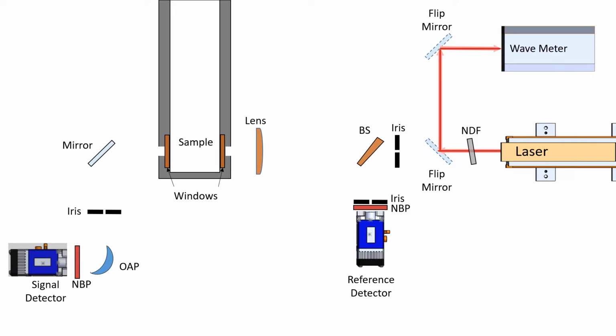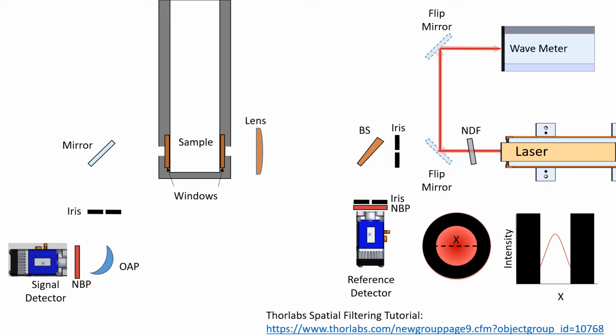Now let's open the shutter. I've eliminated it from the diagram because it's no longer in the beam path. Note the lighter edges of the line. I'm using this to indicate that Gaussian beam profile. If I looked at this laser head on, it would look something like this, where the intensity is greater in the center of the beam. And if you plotted this intensity as a function of position across the center of the beam, it would look something like this, a Gaussian profile.